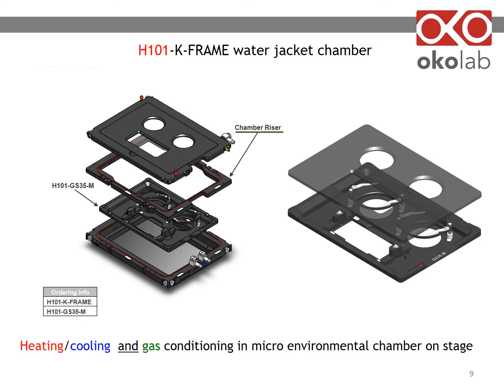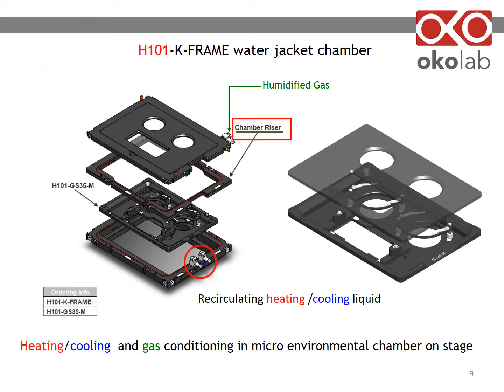Here is an example of a water jacket fitting a K-frame stage with an opening of 160 by 110 millimeters. Connect the tubing for recirculating liquid on its side and the tubing for humidified gas on the fitting located on the lid. The chamber comes with a spacer we call a chamber riser. An insert contains your sample — in this example, the insert holds one slide and two 35 millimeter dishes.